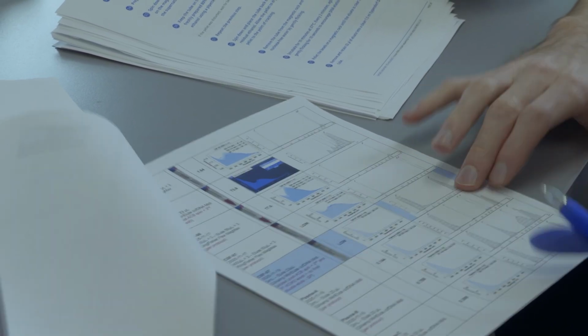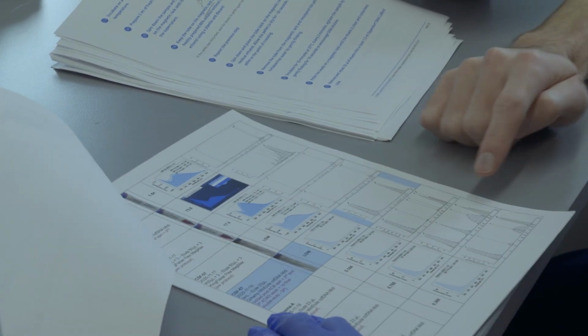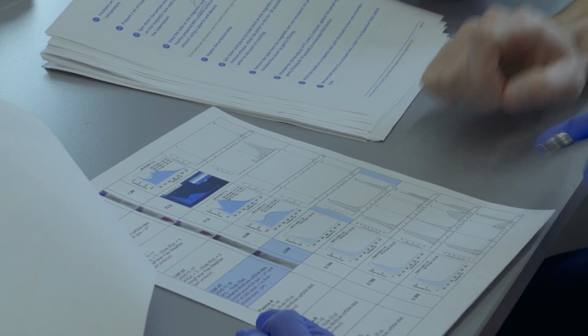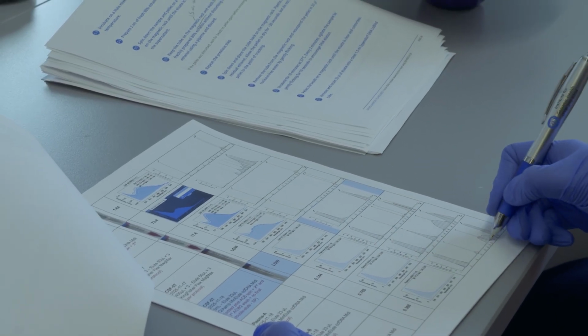So what was these? A, B, C, these are plasma we tried yesterday, in which we are getting a completely different and weird spectra. I think here this is the upper marker, right? Yes, definitely, but there is something here.